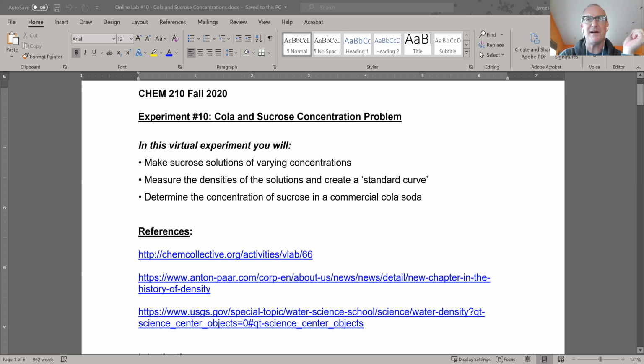It's hard to try to figure out a way to ask the question without giving you the answer. Known concentrations. There you go. Yes. What a standard curve is, and I will just draw right here, is you're plotting the measurements of a series of things. That could be volumes, concentrations of solutions, densities, could be a lot of different things, but they're known because you made them. That's the secret of the whole thing.